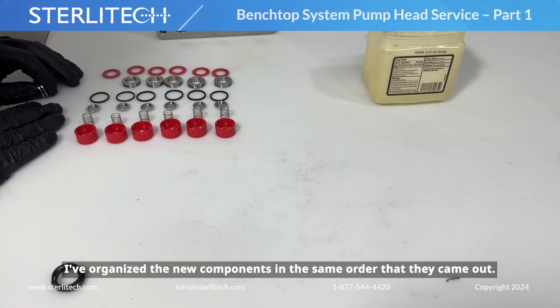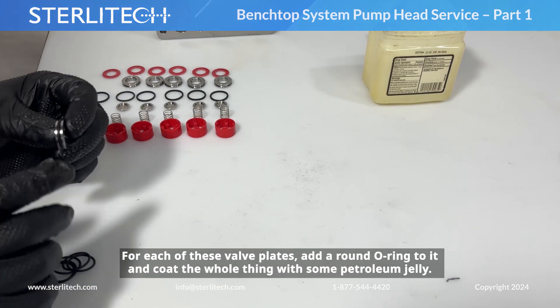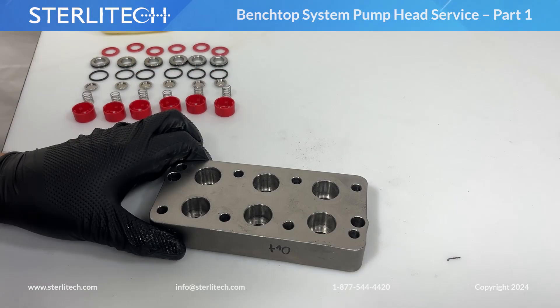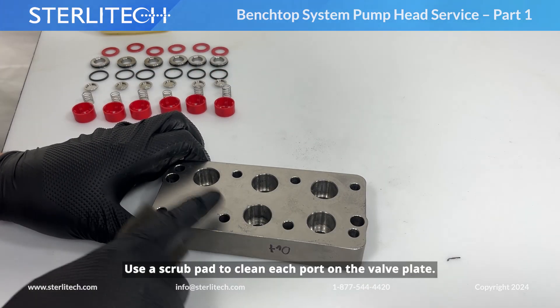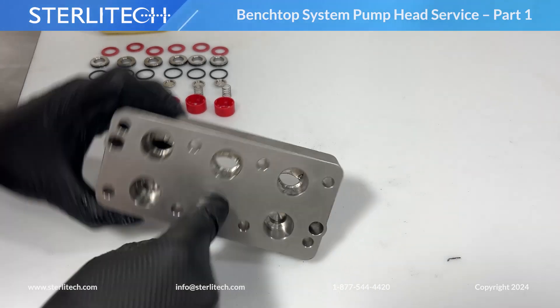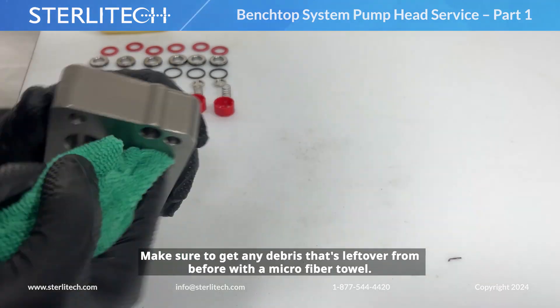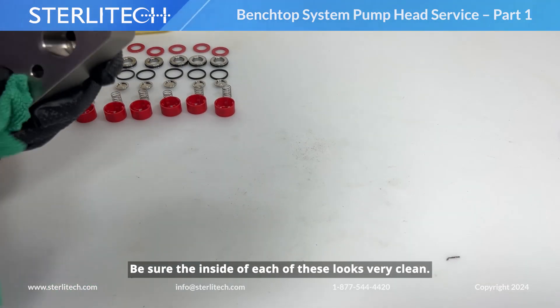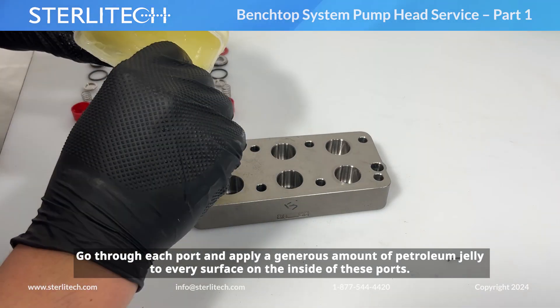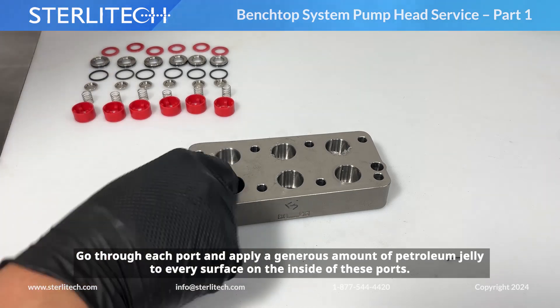I've organized my new components in the same order that they came out. For each of these valve plates, we're now going to add a round O-ring to it, and make sure we coat the whole thing with some petroleum jelly. Next, use a scrub pad to clean each port on our valve plate. Make sure we get any debris left over with a microfiber towel, and be sure the inside of each of these looks very clean. Now go ahead and apply a generous amount of petroleum jelly to every surface on the inside of these ports.